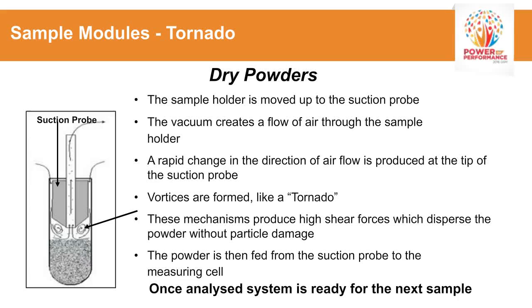And another little closer up, what happens is we create vortices right above the surface of the particles as the platform rises and particles start going through. The computer controls that platform that I mentioned because it wants to control the feed rate so we have a constant flow of particles in front of the beam.